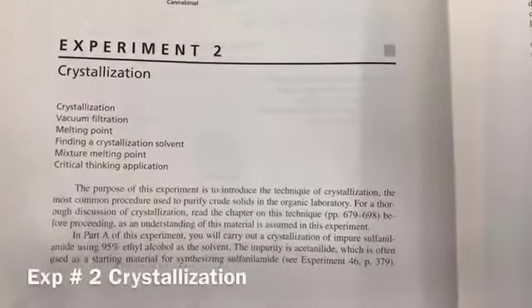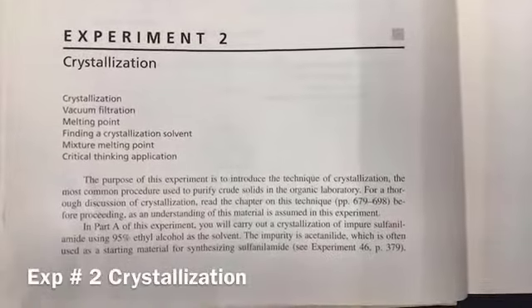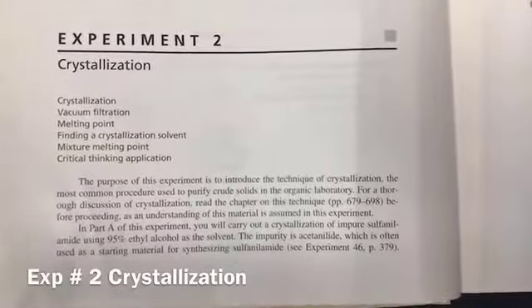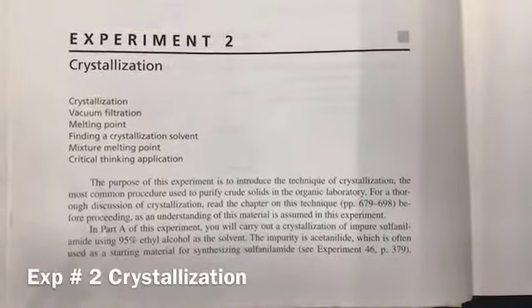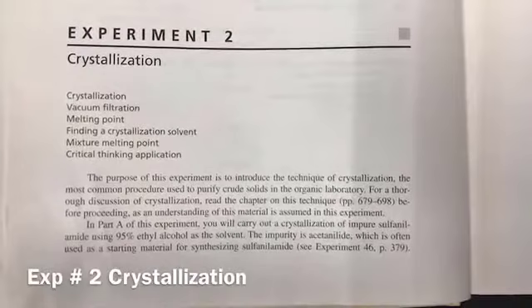Today's experiment is crystallization. The purpose of this experiment is to introduce the technique of crystallization, which is the most common procedure used to purify crude solids in organic lab. And with this experiment, you will learn various new techniques.